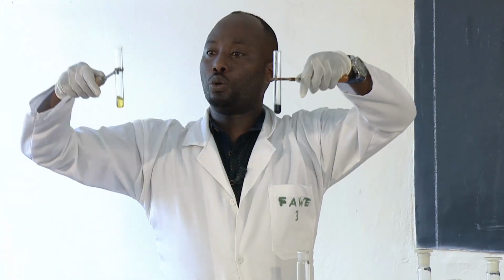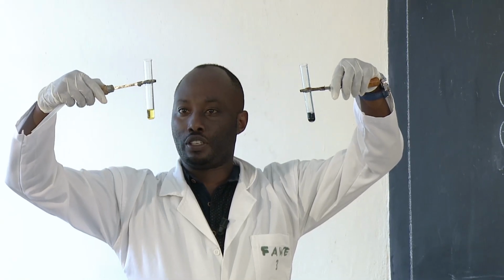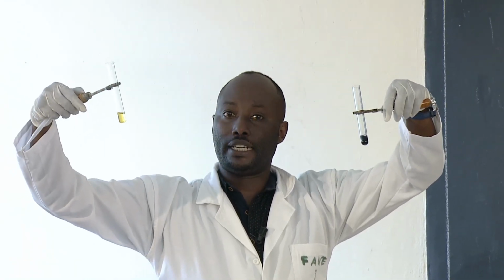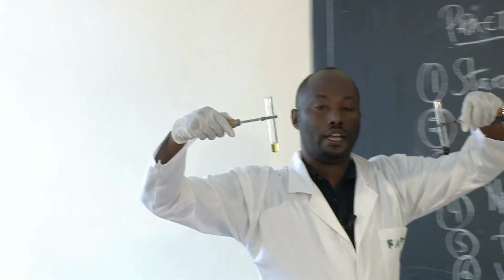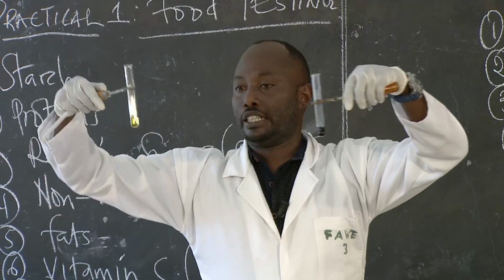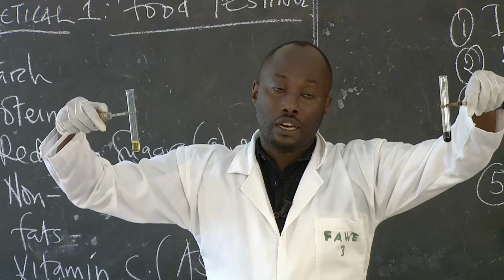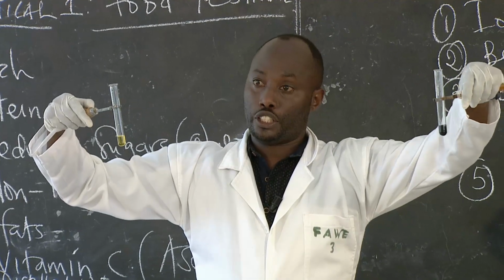You have to observe two test tubes. As you can see, I have two test tubes, one on the right-hand side and another on the left-hand side. Right, left. In one test tube I put water, and in the other I put starch.